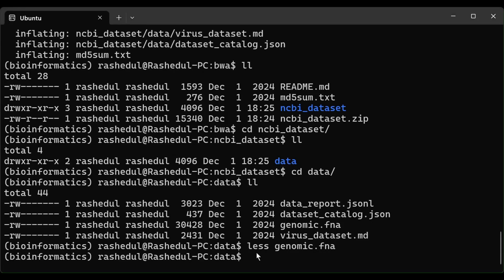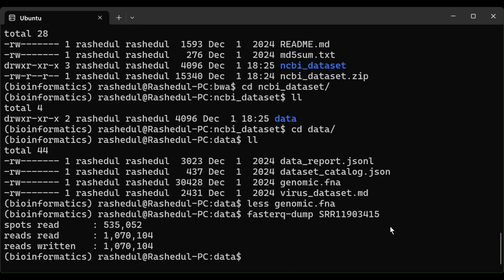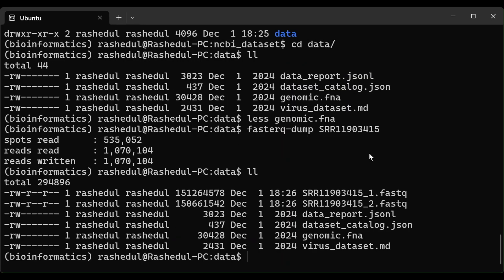Now we will download the paired-end sequencing library using SRA toolkit. We will use the fasterq-dump command and press Enter — this will download the paired-end files into the current directory. The download has finished. The fasterq-dump command has downloaded this library. Since it is a paired-end library, it has two FASTQ files. Now we will align these two FASTQ files to the genomic.fna file.